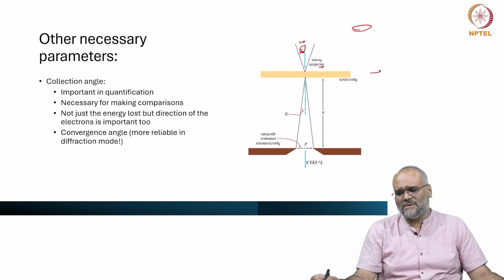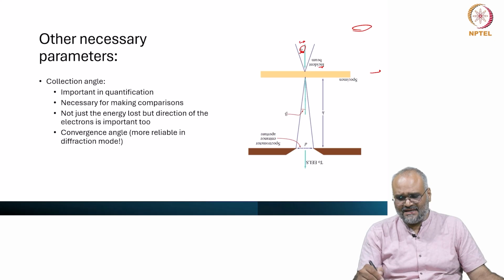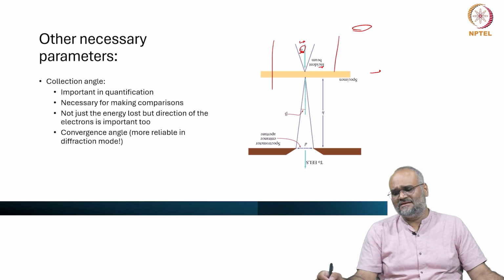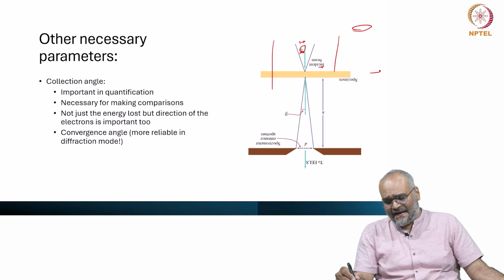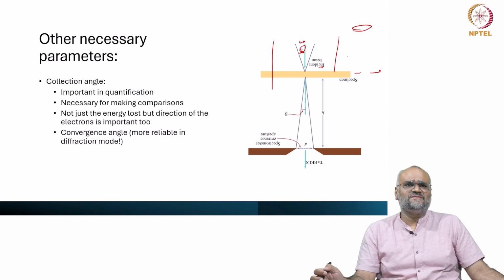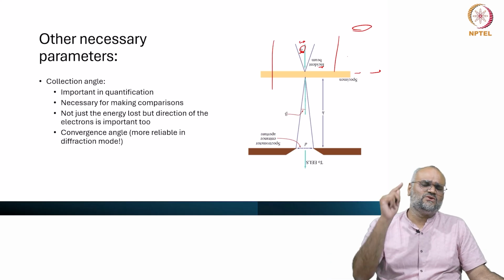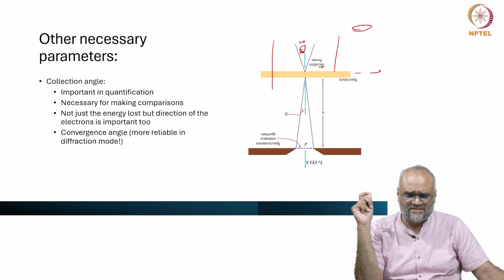Even if I am doing it with a microprobe or a conventional TEM image, based on the condenser aperture I use and the area of illumination I am having, this is kind of fixed. Your convergence angle is fixed, and the brightness and the current density with which your incident electron beam hits the specimen is something which you also need to record for quantitative EELS measurements as well.